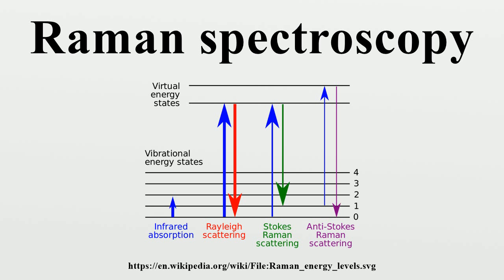Several research projects demonstrated usage of Raman spectroscopy as a means to detect explosives using laser beams from safe distance. Raman spectroscopy has also been used to confirm the prediction of existence of low-frequency phonons in proteins and DNA, greatly stimulating the studies of low-frequency collective motion in proteins and DNA and their biological functions.